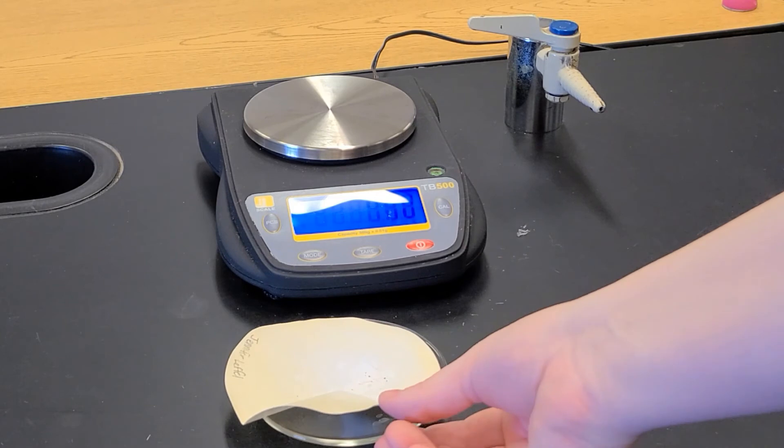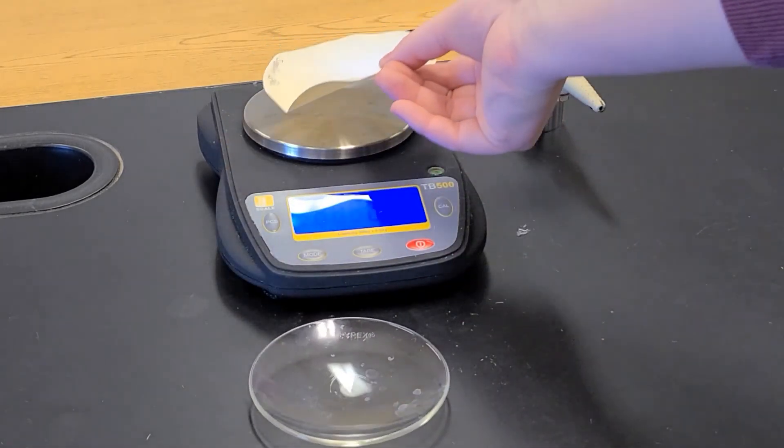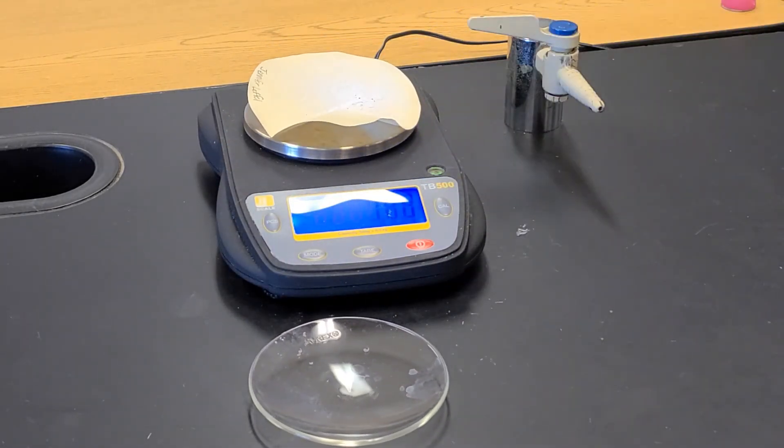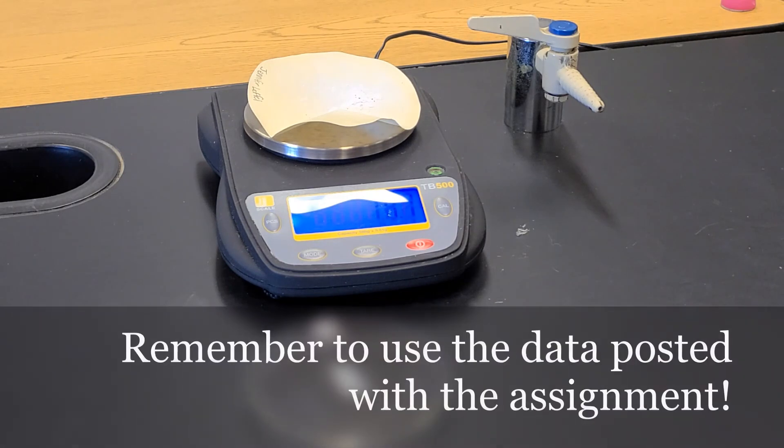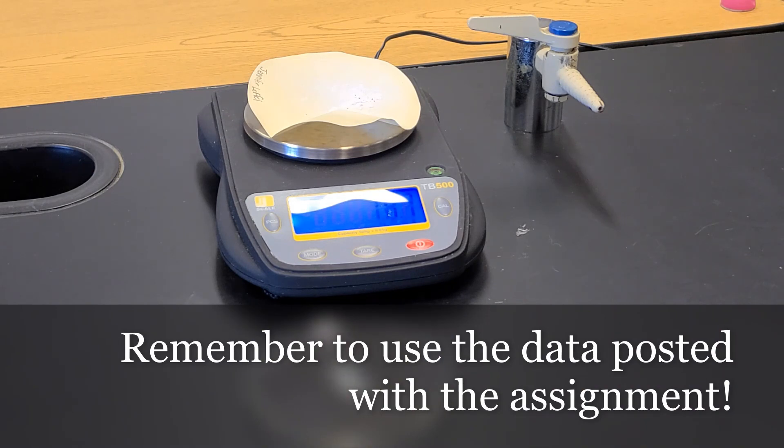Now I'm going to go ahead and mass my dry filter paper. Remember that you want to use the data that's posted with the assignment here, so we're going to use that mass to determine the concentration.